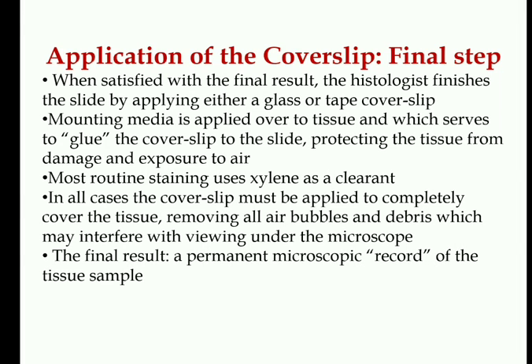Now the final step is application of the cover slip. When satisfied with the result, the histologist finishes the slide by applying either a glass or a tape cover slip. Most routine stains use xylene as a clearant. Mounting media is applied over the tissue, which serves as a glue to the cover slip, protecting the tissue from damage and exposure.